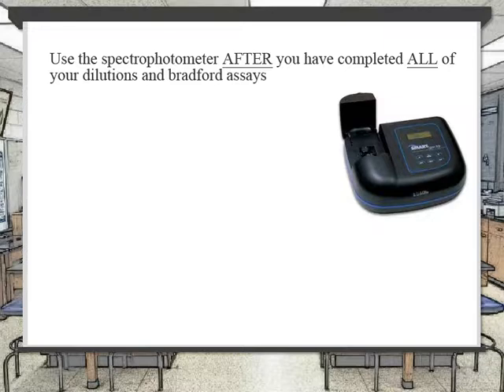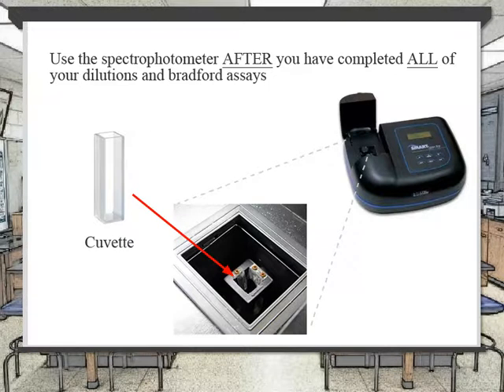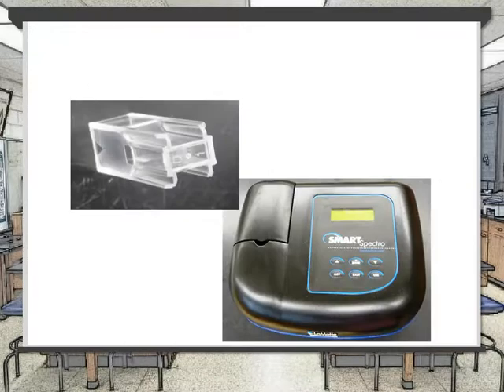When you finish, you will wash all test tubes and cuvettes with detergent using the test tube brushes to remove all traces of blue dye. This is very important, and failure to do so will affect your grade for this lab.